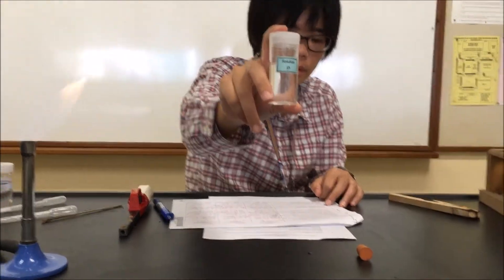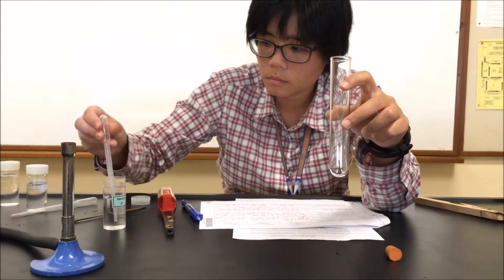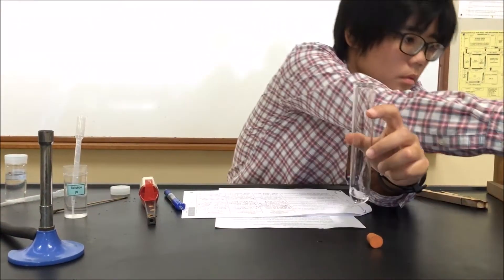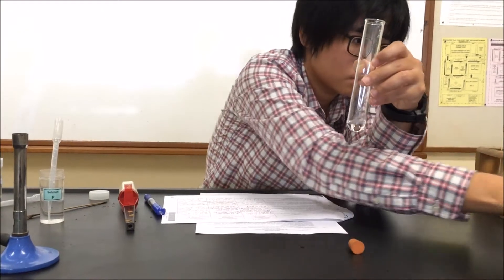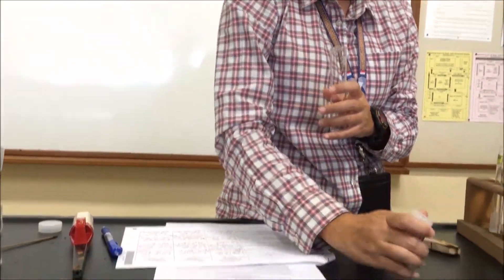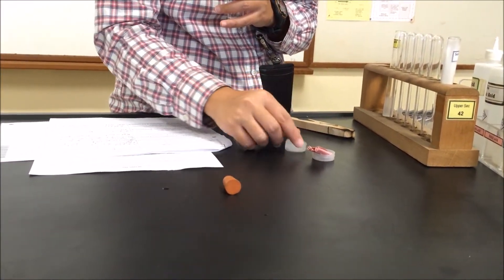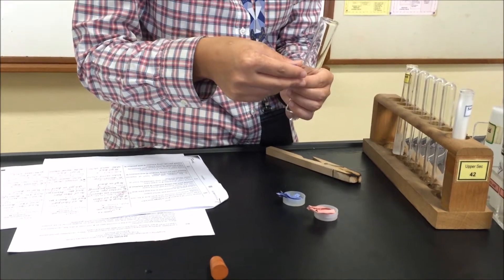Next we move on to Part B, where we will use Solution P. We take one cubic centimeter of Solution P and put it into a large test tube. We will add one cubic centimeter of sodium hydroxide — we do not add excess. The question tells us to gently warm and then test for any gas using litmus. Before you start, you realize that whatever you do for P you must repeat for Q and R, so you will need quite a bit of blue and red litmus paper. Get them ready on a bench, and remember to always dampen the blue and red litmus papers before use.